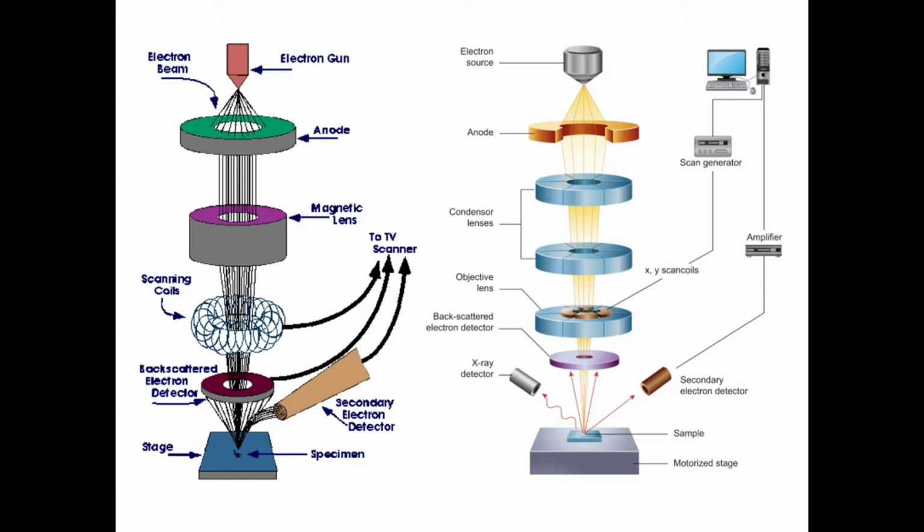Let me come to the last one. We have a backscattered electron detector, and the secondary electron detector, which is nothing but SE.